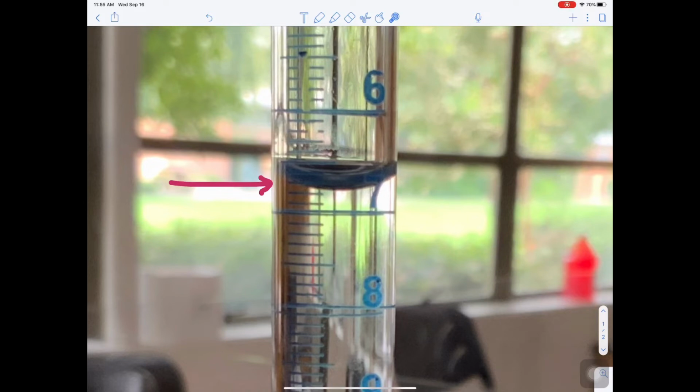And then we need to look at how many divisions are there in between. Well, there's 1, 2, 3, 4, 5, 6, 7, 8, 9. There's 10 divisions. So each line represents 0.1 milliliter. We always estimate one digit. So we're going to read this to plus or minus 0.01 milliliters, because where the lines are, there's no uncertainty. And we're going to read between the lines to get an estimate.